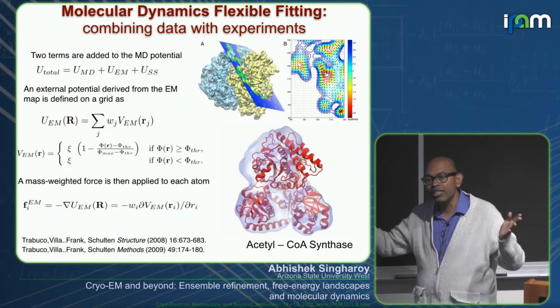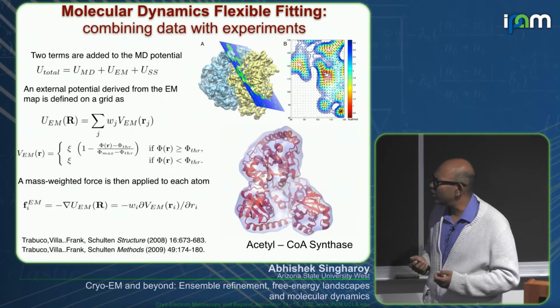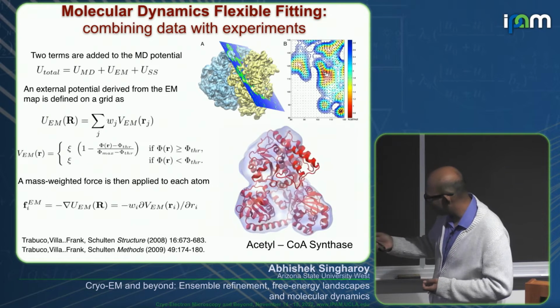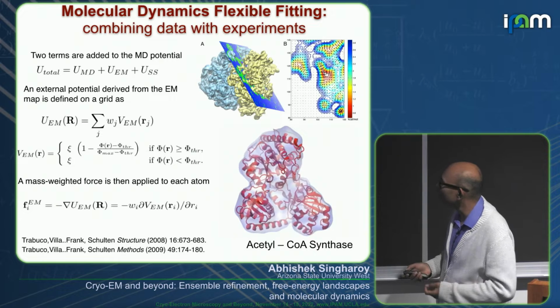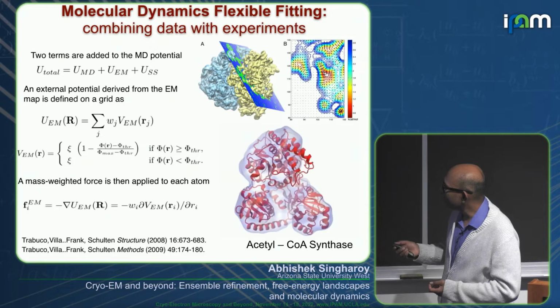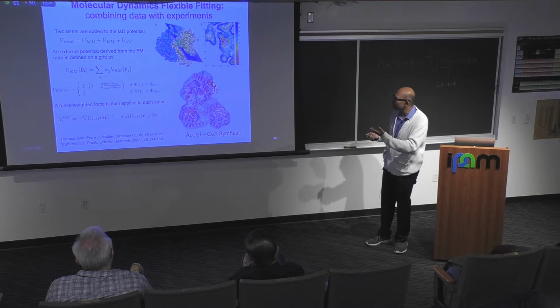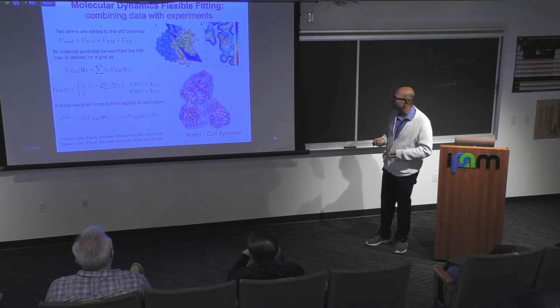So let's say we have these three-dimensional densities. What do we do with that? We want to figure out biological structures. And so the first attempt at that was, you can see pretty low resolution densities. We purposefully keep this example, one of the first examples of taking a structure that is crystallographically resolved and fitting it to the density in order to interpret this density with three-dimensional structures.